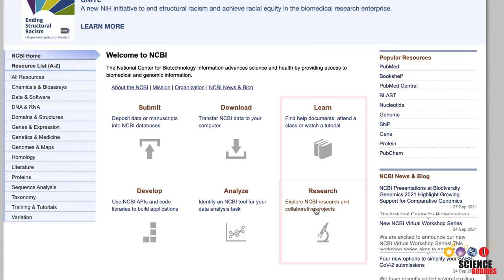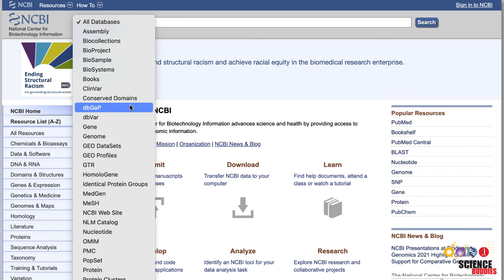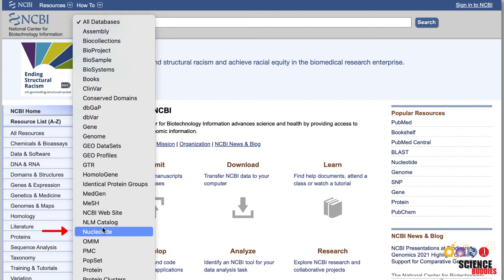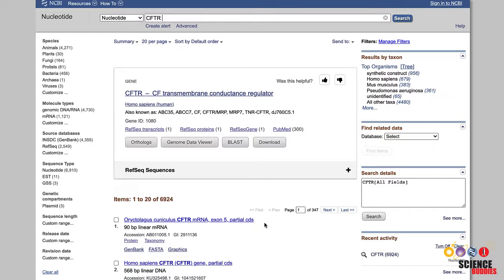If you are interested in specific genes or proteins, you need to use the search box at the top of the page. To the left of the search box is a drop-down menu with a list of all the databases that are available for your search. Depending on what you are searching for, you want to choose gene, protein, or nucleotide from the list. Type in the name of a specific protein or gene and then click search. We will search for the nucleotide sequence of the human CFTR gene, which is linked to a genetic disease called cystic fibrosis. The resulting list includes all the records that matched your search term in the selected database.